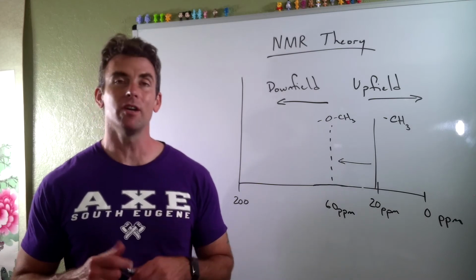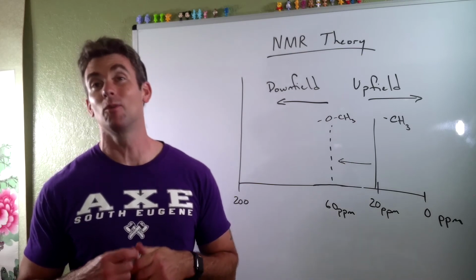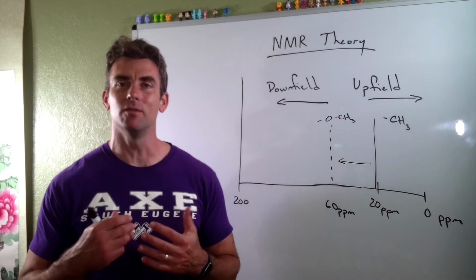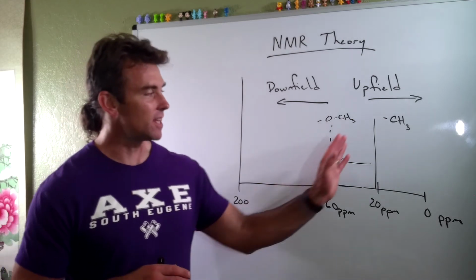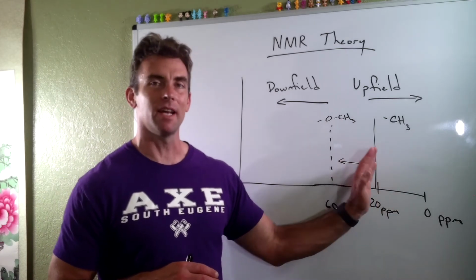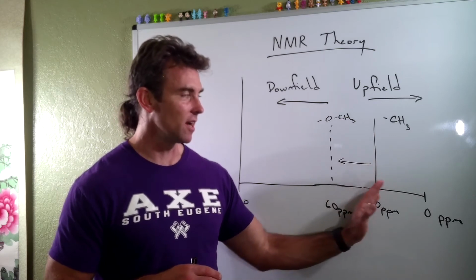And you can look at your correlation guide if you really want to. Get some really good sleep tonight. This video is just about getting us used to recognizing certain trends. So what I would say is, if you are just some sort of boring old carbon that's not connected near anything very exciting, you're going to run in this area here.